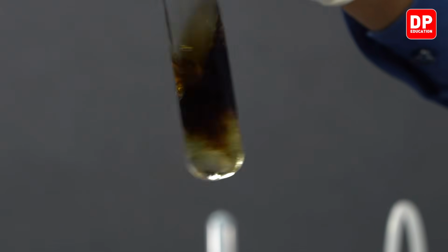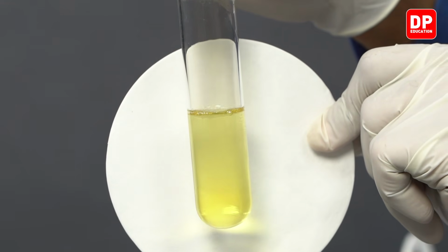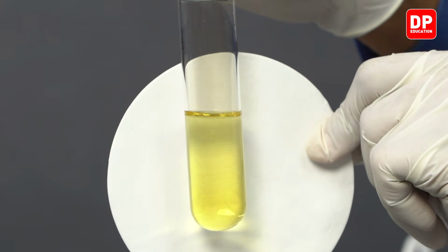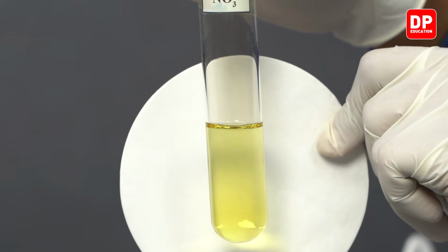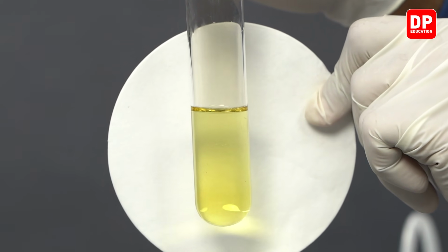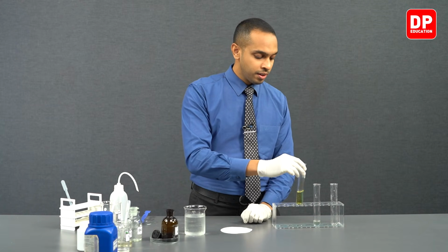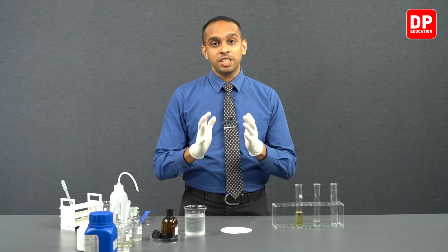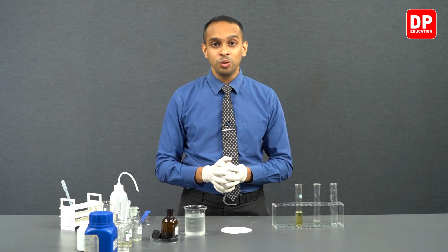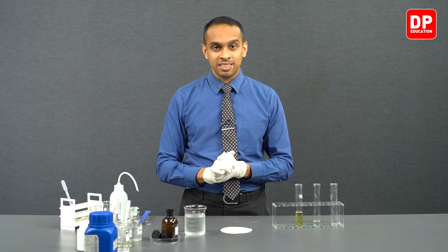If you continuously stir it, we can see that the color completely disappears as sulfuric acid completely reacts with the remainder of the aqueous solution. So now students, with that observation, we have completed yet another test that we can do to identify nitrate ions.